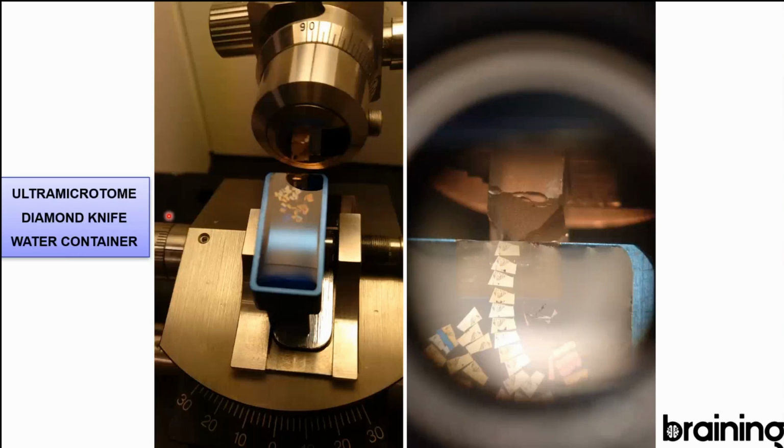So actually, I have a couple of videos here just to show you the actual settings that I'm using in my lab. And these are videos that I took. And on the left side, you see that there's a water container and then the knife. This knife is not a glass knife anymore. This is a diamond knife, which is much tougher, and I can get a lot of sections during my entire life. And as you see, here is the water container. The diamond knife, sorry, is here at the very tip.